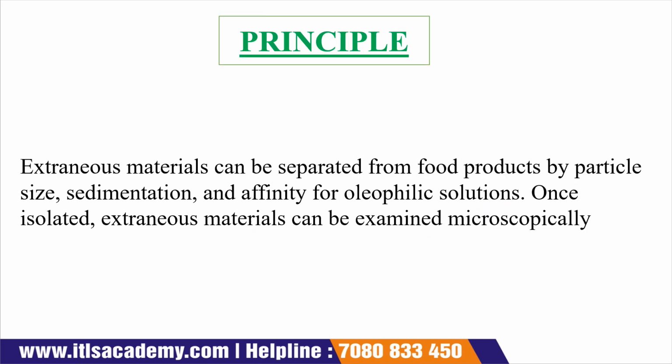Now the next one is the principle of this experiment. The principle is the same as we already discussed in the previous lectures. First of all, we have to separate the extraneous matter present in a food product, and this separation is done on the basis of particle size, sedimentation, and affinity for an oleophilic solution.